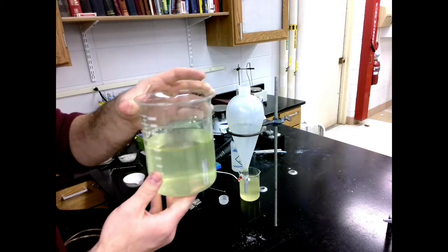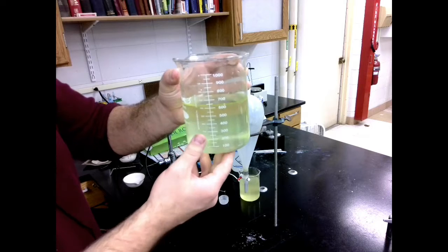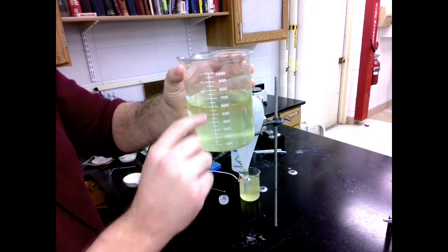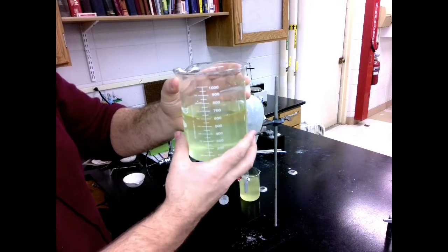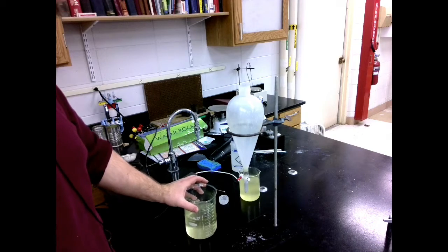So now that we've collected about 600 milliliters of our distillate, I've got clearly a thin film of oil sitting on top of the water here. I need to be able to separate that out. In order to do that, we're going to be using what's called a separatory funnel.